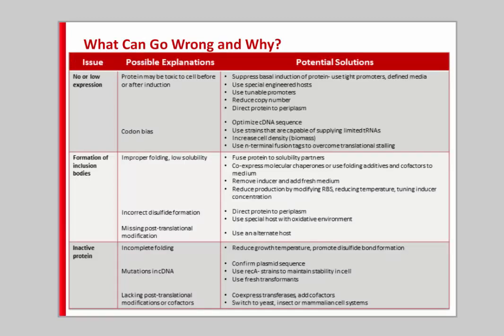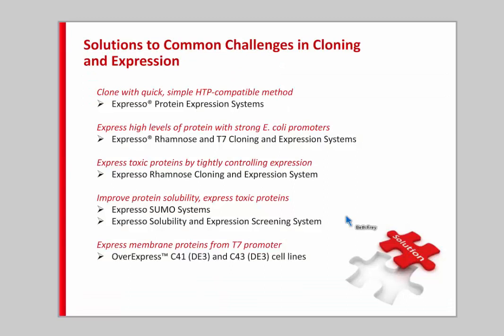Here is a table that lists some of these problems and the source of the problems that we talked about, and some potential solutions for these issues. I'm not going to go into all of this in detail. There's a lot of information here, but just note as you skim this that the solutions to these issues span the entire workflow we just discussed. In order to implement some of these solutions, you have to go all the way back to the cloning step, and in some cases even to the design of your DNA sequence. So some of those solutions are very time intensive and can really stop or even reverse the progress of your project. So here are some solutions that we're going to talk about today in the context of challenging applications that you may have.